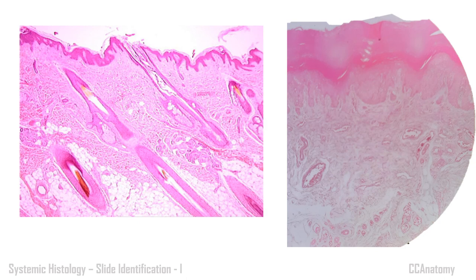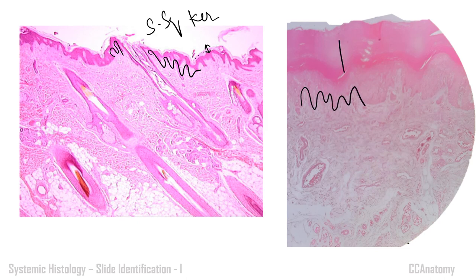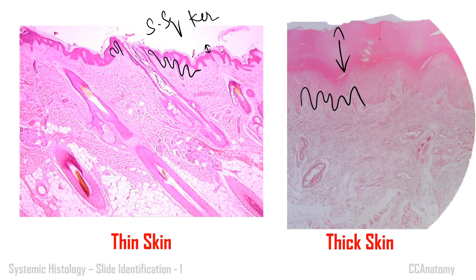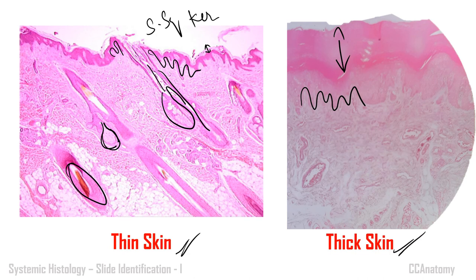Now identify this epithelium — the wavy pattern again indicates stratified squamous epithelium. Check if it is keratinized or non-keratinized. In one slide you can see a thin sheet of keratin on top — that is thin skin. In another slide you can see the same wavy pattern but with a thick layer of keratin — that is thick skin. Additional identification features: thin skin has hair follicles and sebaceous glands (sebaceous gland opening into the hair follicle). Thick skin has sweat glands with their ducts visible. Hair follicles and sebaceous glands are absent in thick skin. These features differentiate thin skin from thick skin.